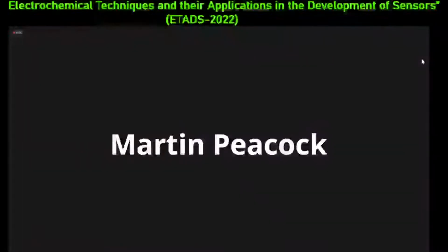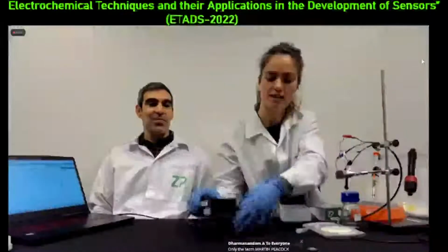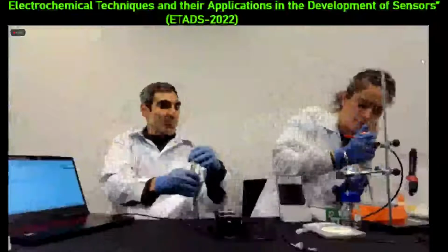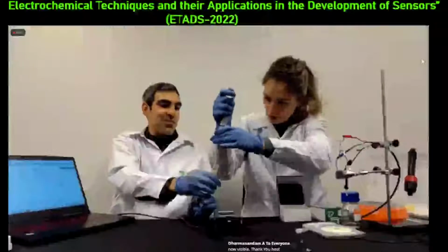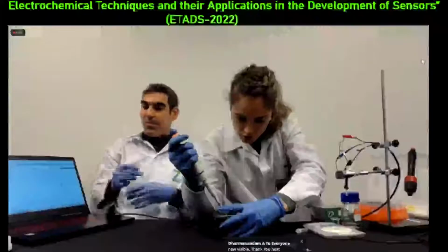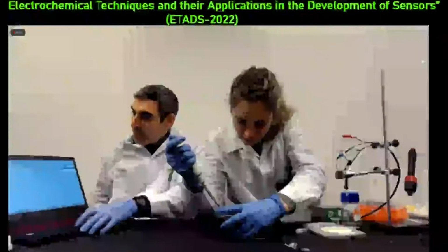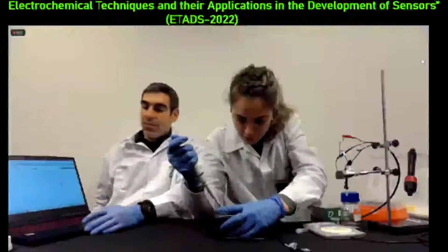So in case you found your way to our screen, here is the HyperValue sensor inserted into the potentiostat. And what we'll do next is we'll pipette 50 microliters of the ferrocyanide solution that Martin was talking about, and we will pipette that onto the electrodes so that it covers all of the electrodes. That it covers the electrodes is a bit hard to show you, as it is such a small volume, but this will suffice.